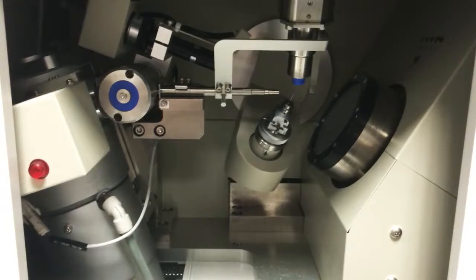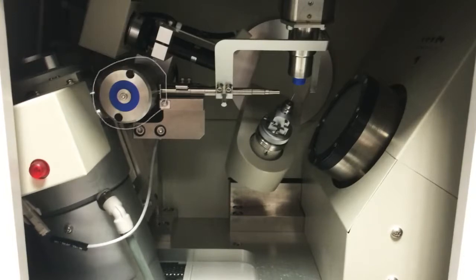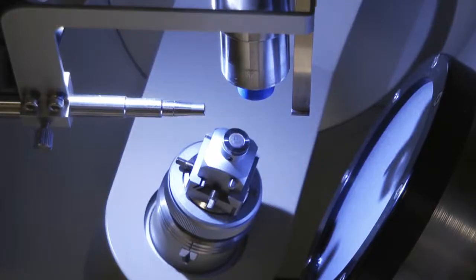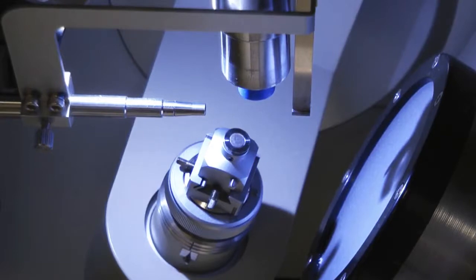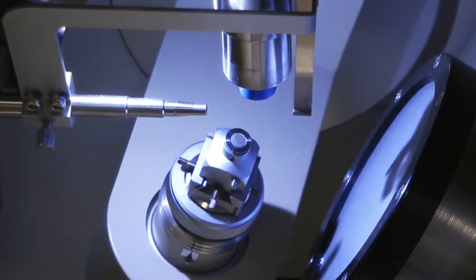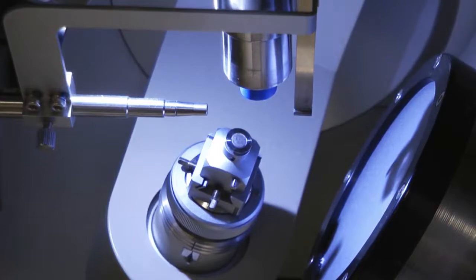The X-rays are generated here and focused onto the centered single crystal using specialized optics. The X-rays are emitted from the collimator. The goniometer is responsible for changing the orientation of the sample in the X-ray beam, and the diffracted X-rays are then recorded by the detector on the right. A beam stop is located directly opposite the X-ray source to block the transmitted X-rays and prevent burnout of the detector.